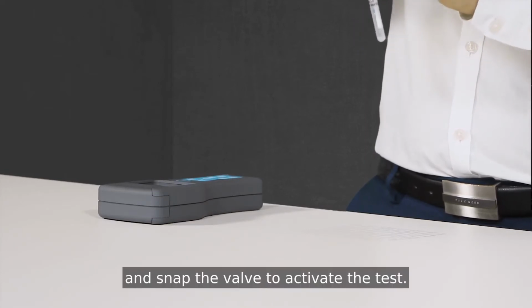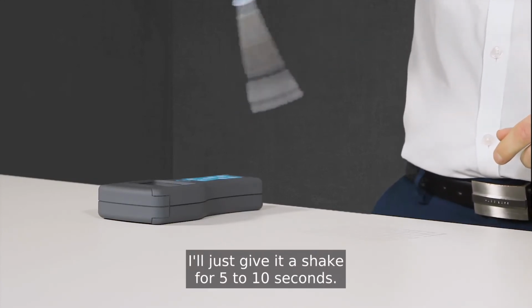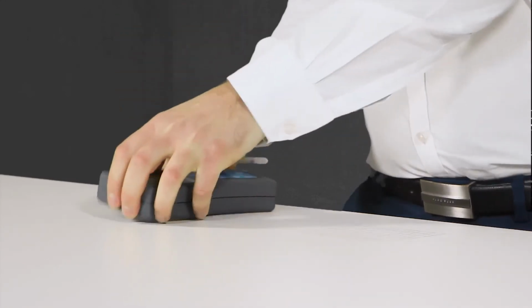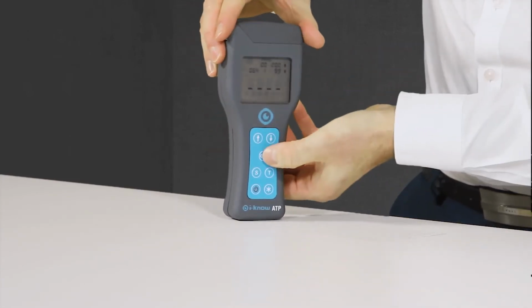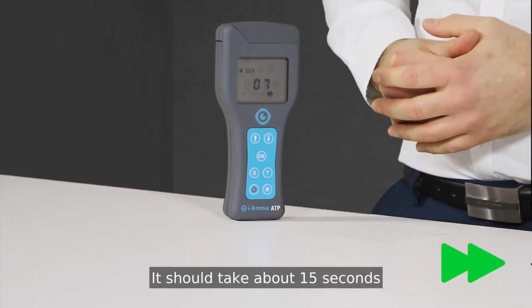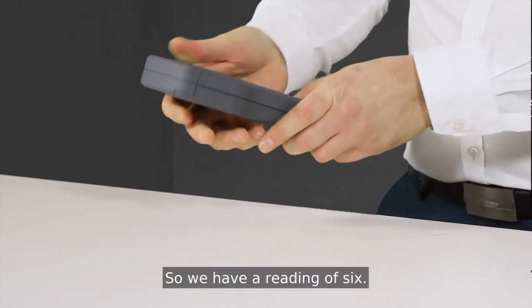I'm going to snap the valve to activate the test. And just give it a shake for 5 or 10 seconds. I'm going to place it in the reader. Press OK, and we should be good to go. It'll take about 15 seconds to give us a reading. So we had a reading of 6.